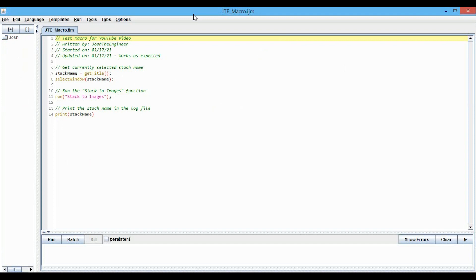This macro simply takes a stack that you've opened and splits it out into individual images, which is what the Stack to Images function is doing, and then it prints the name of the stack to the log.